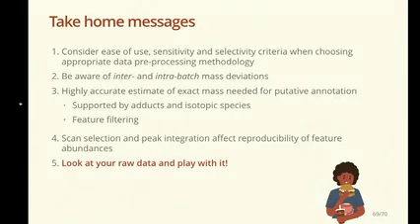So some take-home messages. Whatever software you use, each has its benefits and disadvantages. Consider the ease of use, sensitivity, and selectivity criteria. Be aware of what your data looks like, the differences, and account for it. Don't just blindly do the data analysis or the processing without thinking about it. If you want to go to feature annotation, it's a lot of work, but it can be done, and hopefully I can share some tools with you quite soon.